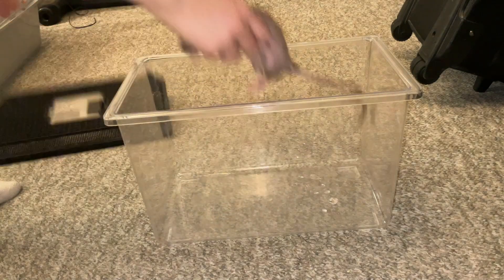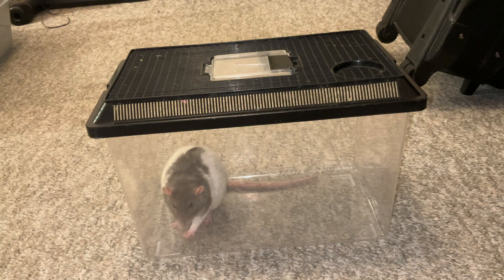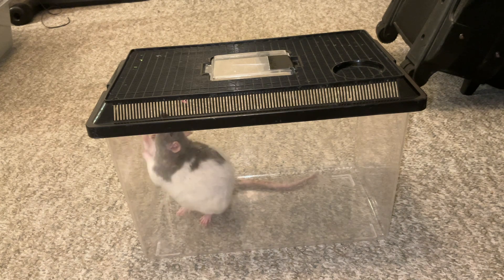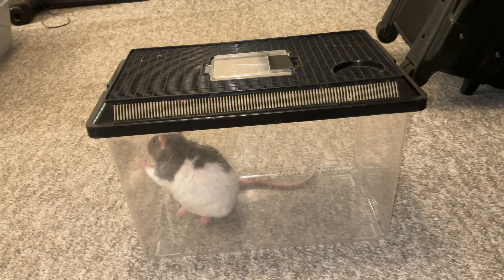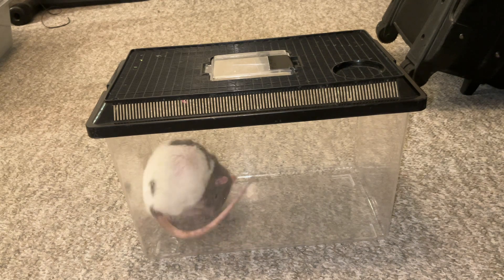Another thing you can do is take your carrier and put it in the fridge for a few minutes, then take it out and put your rat in it. The cold stimulates them to pee, so this is a quicker way to get their urine. You can also take them out when they're sleepy — oftentimes when they're deep asleep and you take them out, they'll need to pee right away, which is another good way to get a sample quickly.